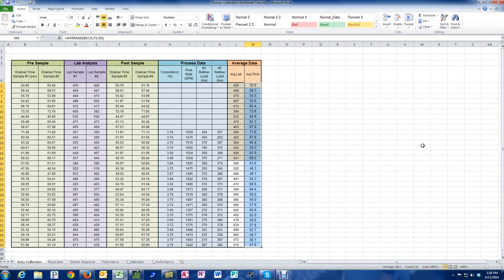Okay, hi, this is going to be a short video on how to build a calibration using your Drainac drain time assessments and your lab assessments, manual lab assessments of CSF, stock freeness. First of all, you want to collect data.